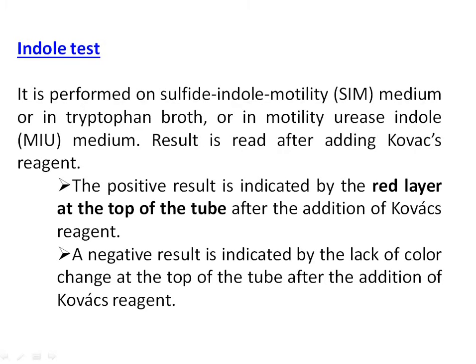The positive result is indicated by a red layer at the top of the tube after the addition of Kovacs reagent. The negative result is indicated by no change of color at the top of the tube after the addition of Kovacs reagent.